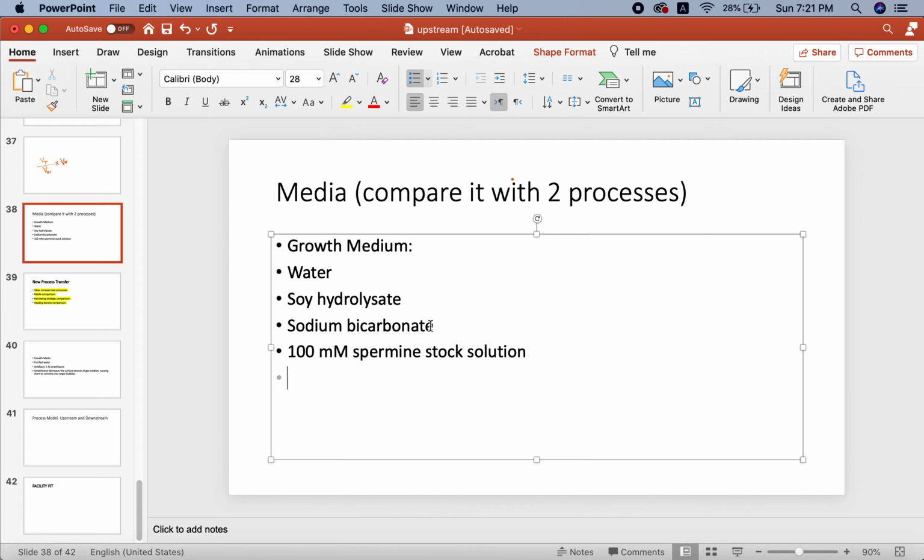Drilled pipe, 15 micrometer sintered sparger. Drilled pipe, initial temperature 36 degrees Celsius. Molecule dependent process option. Add as a bolus as needed.